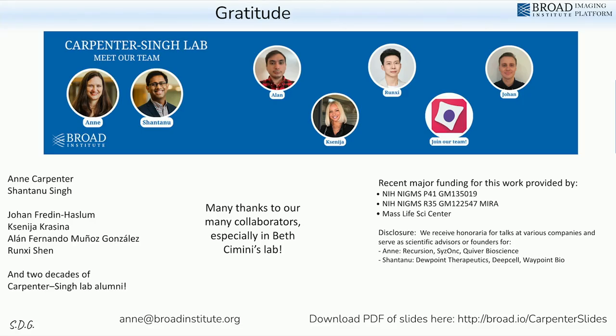Hi, thanks so much for the talk. I'm not directly in the field, so I'm probably way behind the news, but I seem to remember seeing some publications a while ago that suggested that bright field images or label-free images actually have a lot more information because you get anything that scatters light and not just the 5 or 6 markers you're staining for. So I'm just wondering, can you tell us a little bit about whether you're exploring bright field imaging, label-free imaging, and where the field is at in that area.